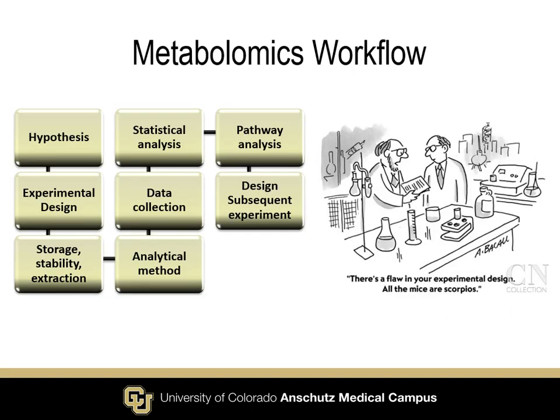So the typical metabolomics workflow, you theoretically hope that you have a hypothesis that you want to test. But the important part is the experimental design, because if you don't actually have a good experiment, then again, junk in, junk out. You want to think about the storage and stability as well as the extraction procedure that you're using. And not only that, the analytical method, and then Dan and Ursa will talk about the data collection and the statistical analysis aspect of it.